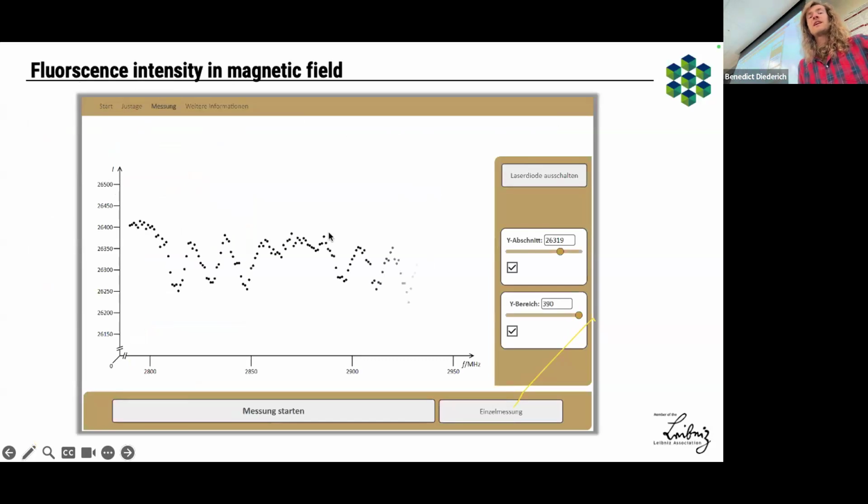When you change the frequency at which you pump the crystal, you see that the fluorescence will change here. So you see the different resonances from a crystal. And this is all done for, well, I wouldn't say elementary schools, but somewhat schools. And with a system that is printable, but luckily we can also produce it. So it's nice for our company. And it's fully open source.